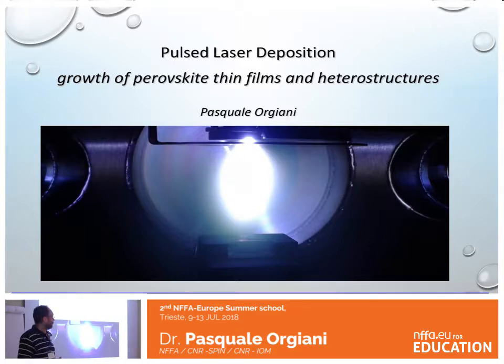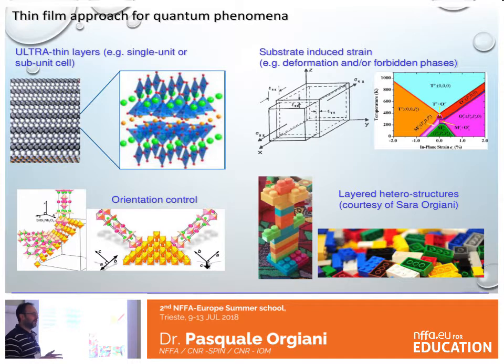And today I will talk about the possibility of growing perovskite films and heterostructures by pulsed laser deposition. Not only perovskite, but this will be an introduction to PLD. And then, if there is time and you are not so hungry, I can also show some non-oxide thin film.